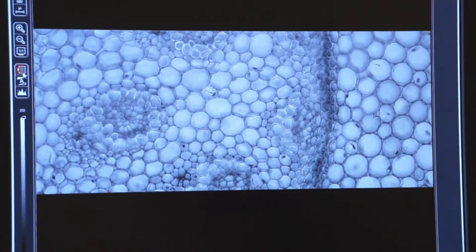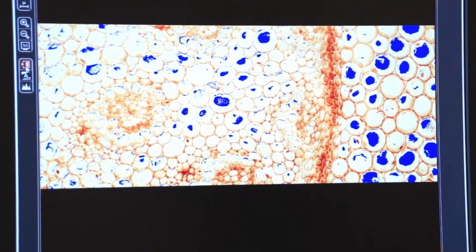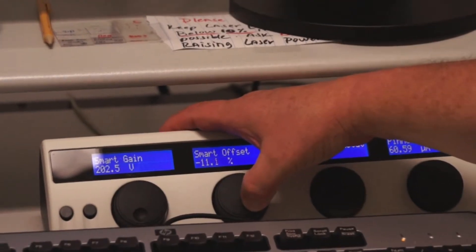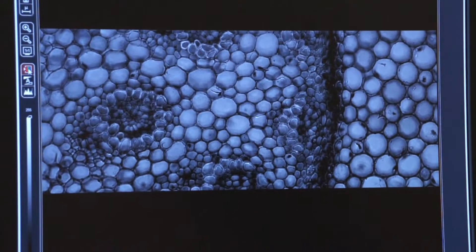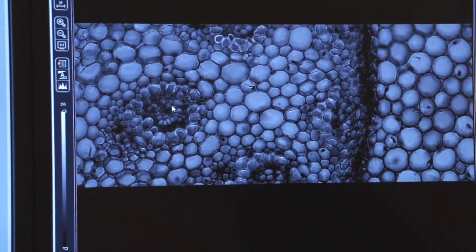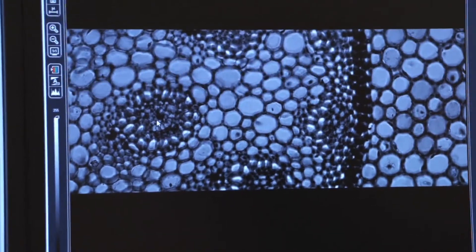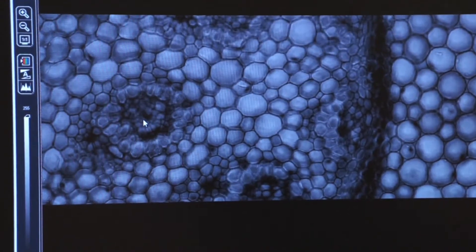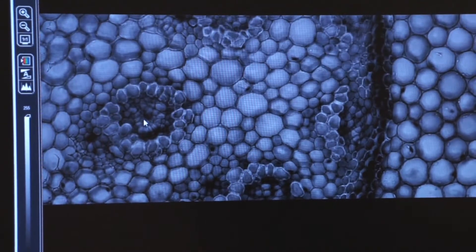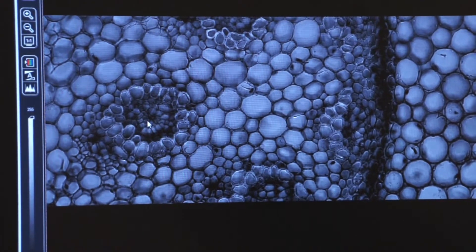Again, I can use my lookup table to look at blue pixels, minimize those, and green pixels. Get a few green pixels, and now double click through my lookup table. Now I have a decent transmitted light image. But notice how it changes dramatically when I focus back and forth through the specimen. Transmitted light is returning more information to you about the specimen than the fluorophores are. So your focus is very critical both on transmitted light and in fluorescence.